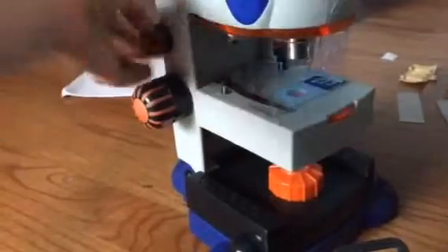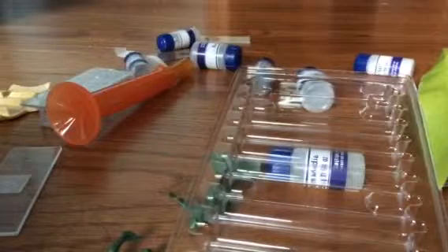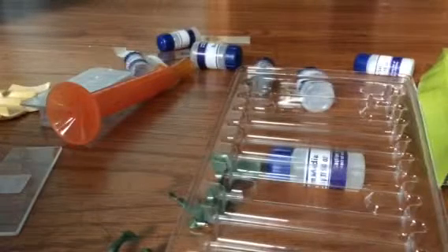This thing — I don't know if you can see — but it modifies the view and stuff. The light modifies the focus of the light. Now, I don't think you can see that. But we have these here, and in this wrapped up piece of tissue we have some discs — some clear ones which you can put some things in. We also have some labels to put some stuff into. We've got cells and various substances.